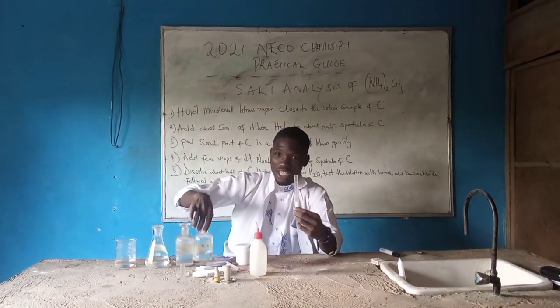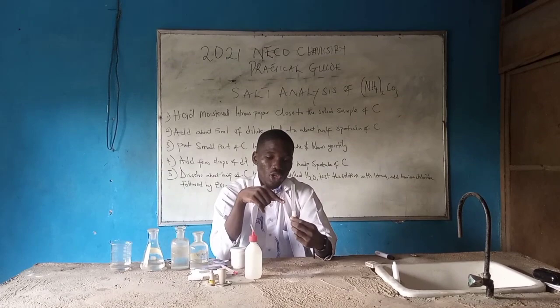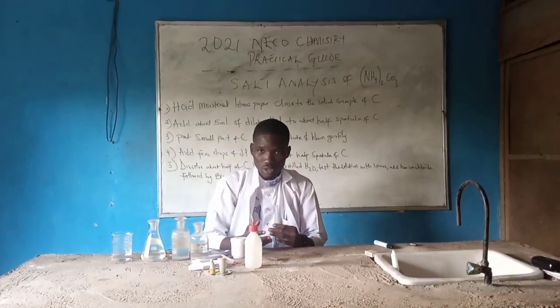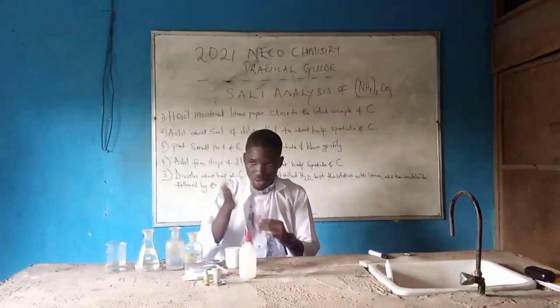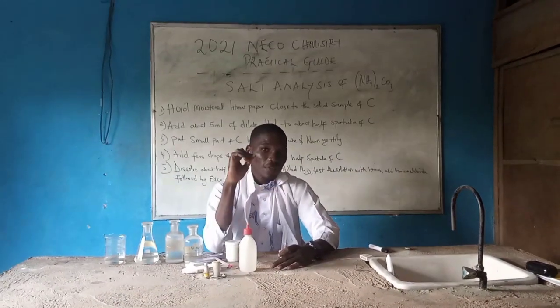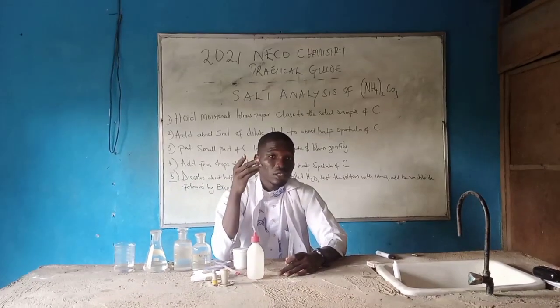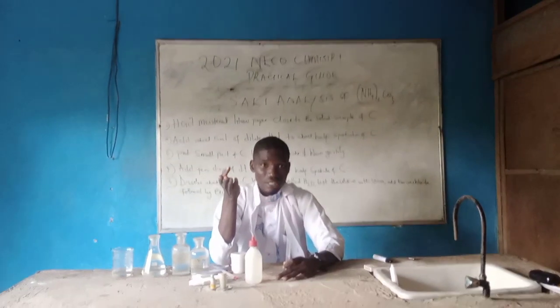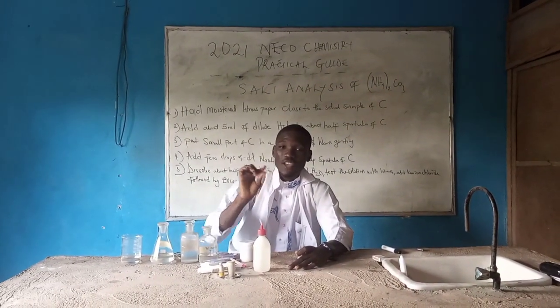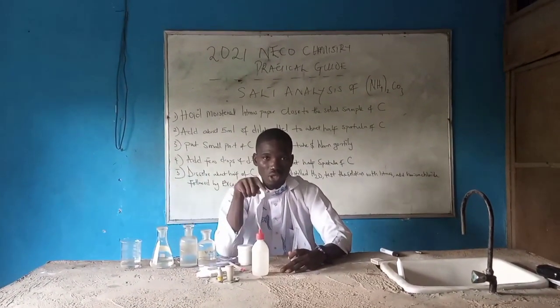When you pour the dilute HCl into sample C, as you can see, it evolves a gas — effervescence. It turns lime water milky. And when you waft to smell the gas, it is odorless. So the observation is: effervescence, turns lime water milky, odorless. The inference is: carbon dioxide, CO₂. Carbon dioxide is colorless and odorless. The inference will be: from CO₂ to CO₃²⁻ confirmed — that is, carbonate is present.